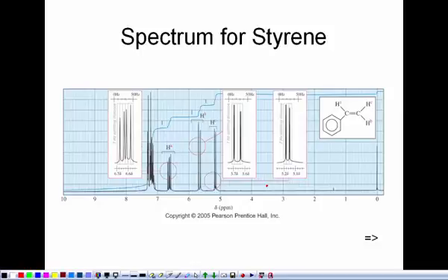What we will do next week is I'll give you some spectra of pentyl and butyl bromides. And so if you think about butyl bromides, there's 1-bromobutane, 2-bromobutane, there's isobutyl bromide. There's all the different alkyl groups. What we're going to do is look at the patterns and try and figure out which pattern goes with which type of NMR spectrum. So we use the coupling, we use the integration, we use the whole 9 yards.